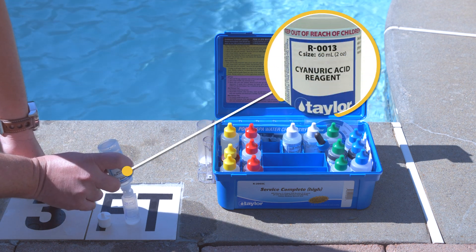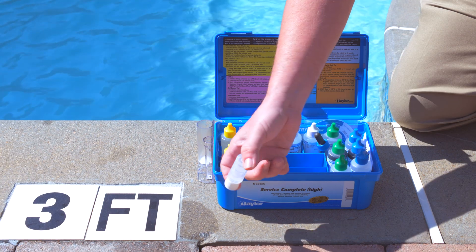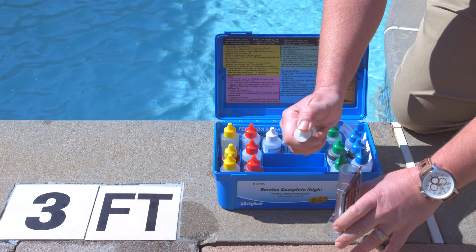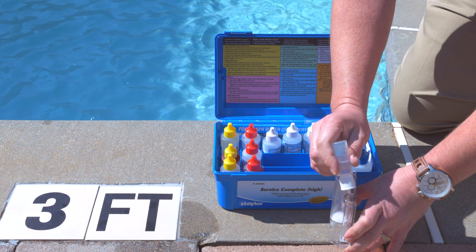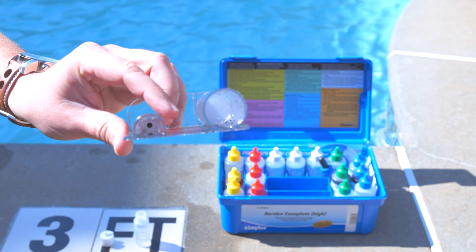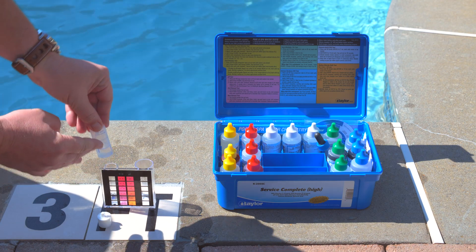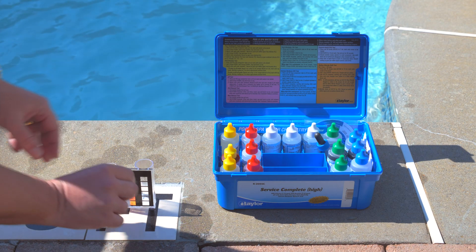Then use the appropriate reagent. Mix the solution for approximately 30 seconds. Then add the mixture to the test vial one drop at a time. Watch for the black dot at the bottom of the vial. Once you can no longer see it, match the water line to the concentrate level on the vial.